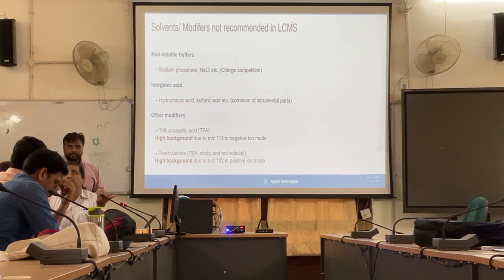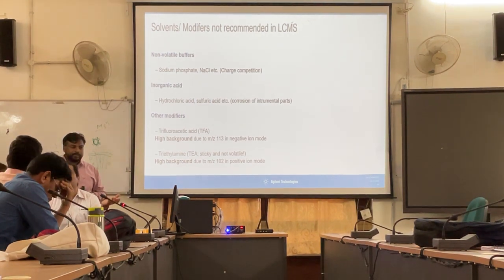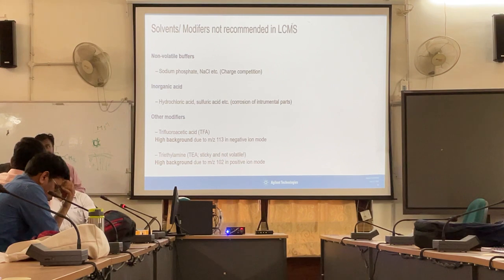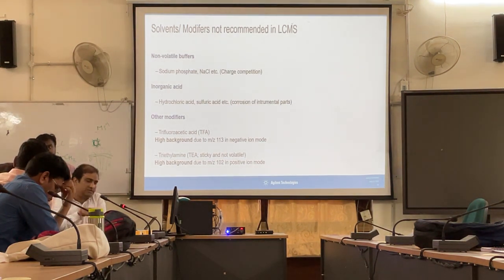And there are other modifiers. It is not necessary you use triethylamine. If you use acetic acid, it can give the same effect. If you use ammonium acetate, it can give the same effect. So you have to try some other modifier except these.